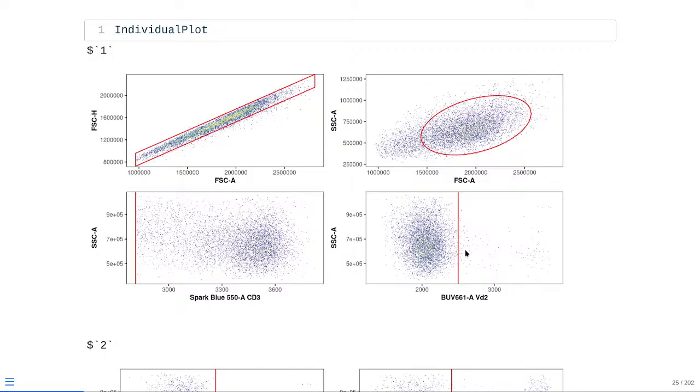Now, one thing that a few of us have encountered over in the discussions over the last couple weeks has been when you're applying an OpenCyto gate using autoplot, those bi-exponential scales you see on the X and Y axis are not the actual numbers that the gate_range argument in your OpenCyto template is using when it comes to applying the gates. So one benefit of utility_gatingplots is the numbers that I see here are actually what's used when it's creating your OpenCyto template.